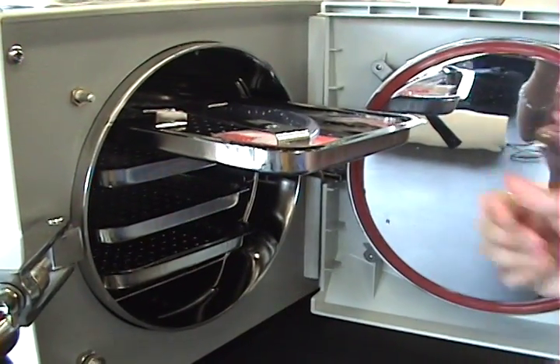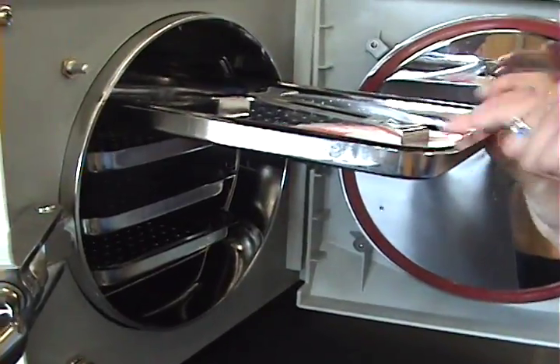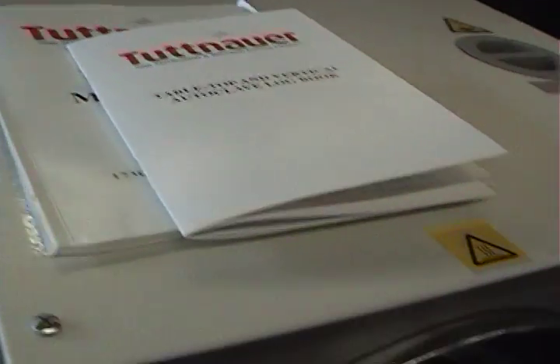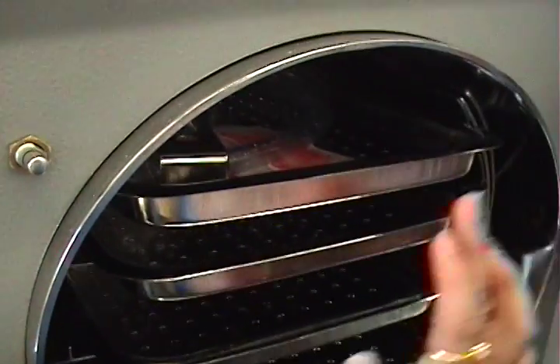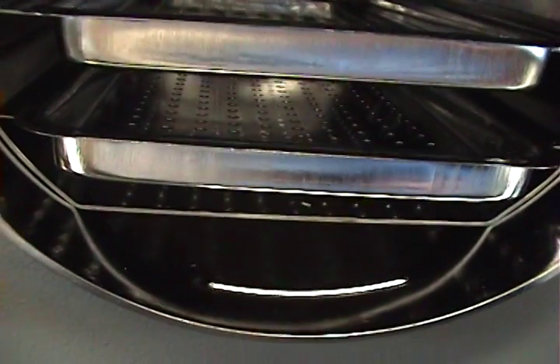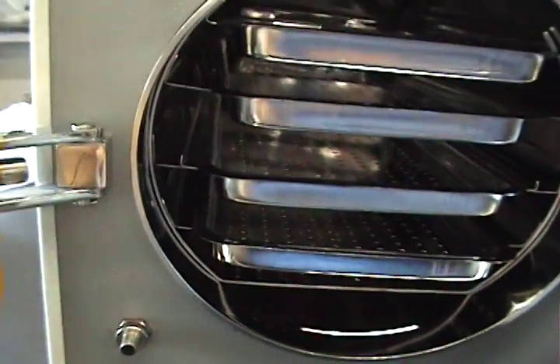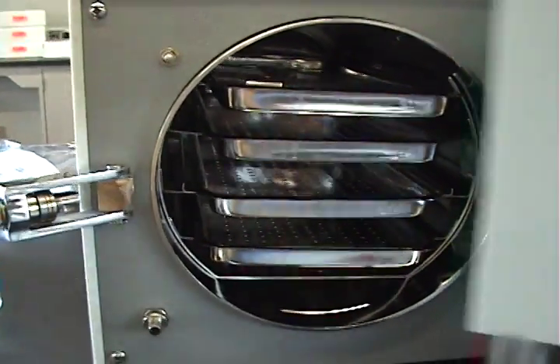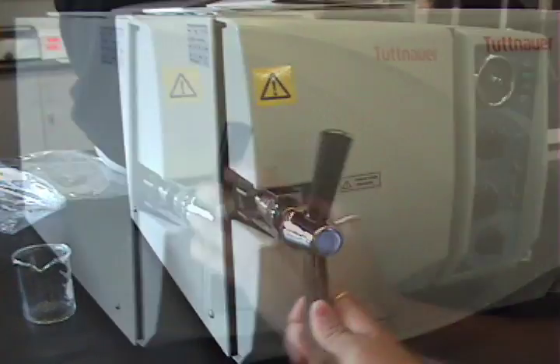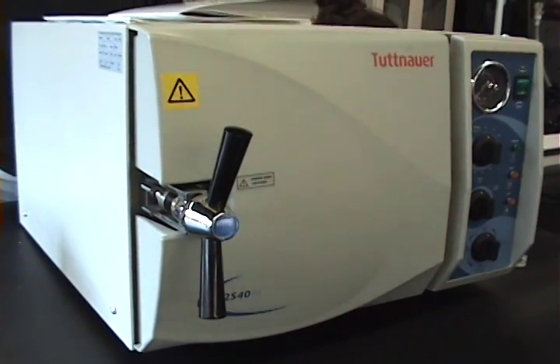Replace all trays and equipment: the cleaners, the clamps, the tubes, and even the manuals on top of the autoclave, so the next group can use them. Close the door. And that is the autoclave.